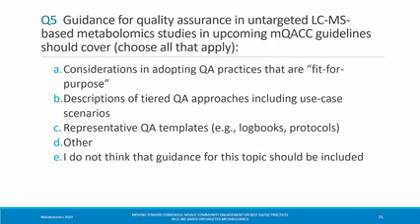We can establish an agreement, for example, for lipidomics in plasma. It's an option, or for any other tissue, for example. Or we should organize this according to the technique and the retention mechanism, and of course for the matrix. This is my approach. Thank you. All right, thank you. Thank you for your response.